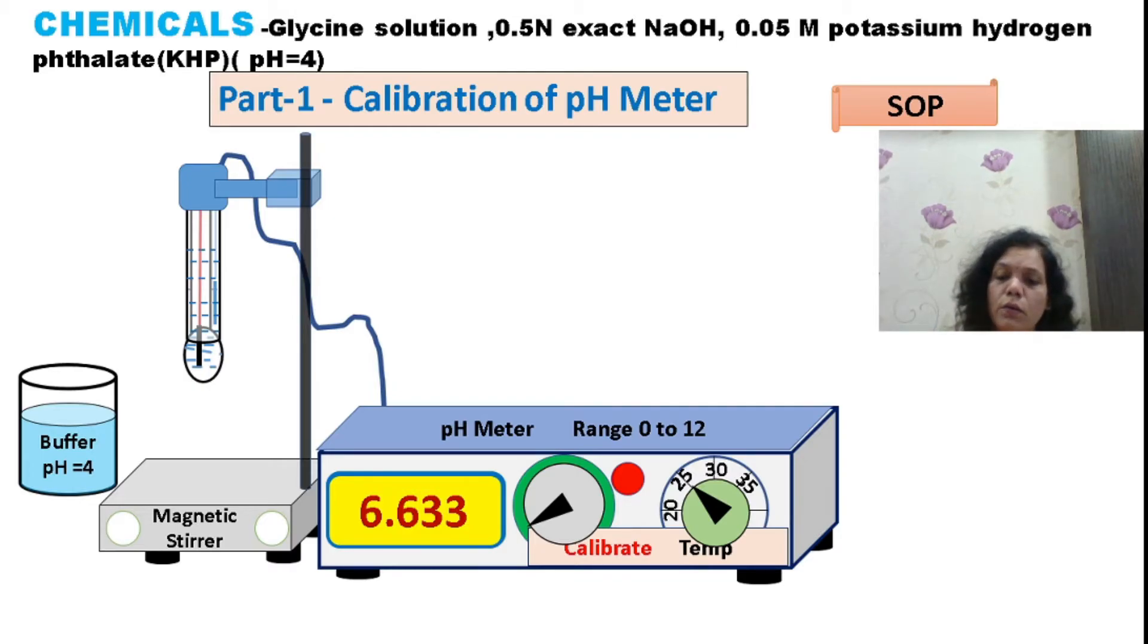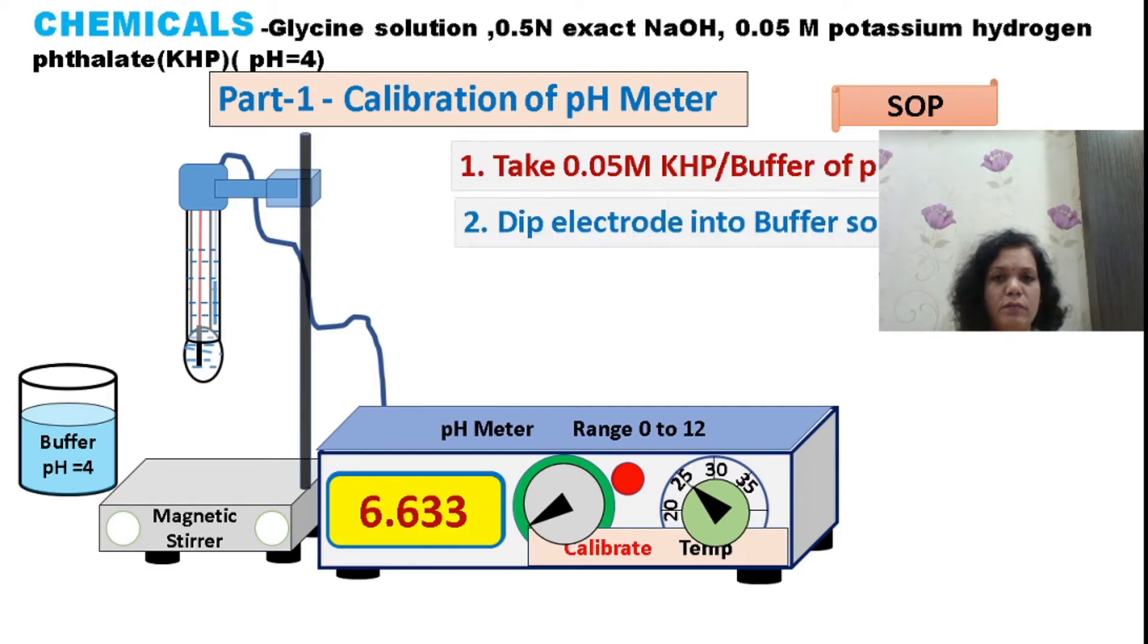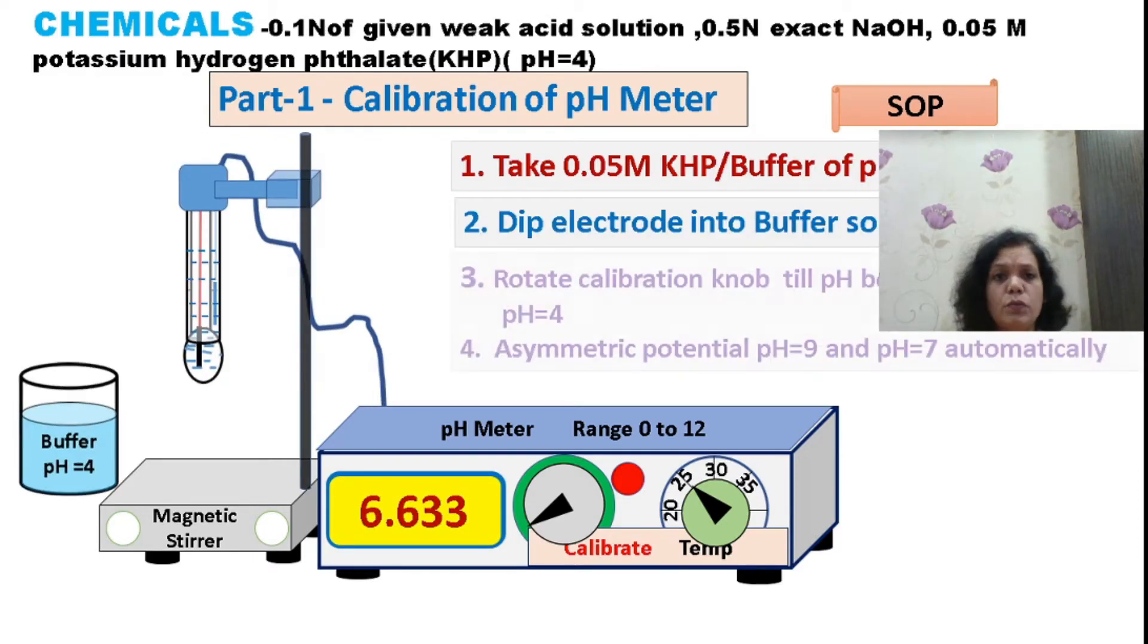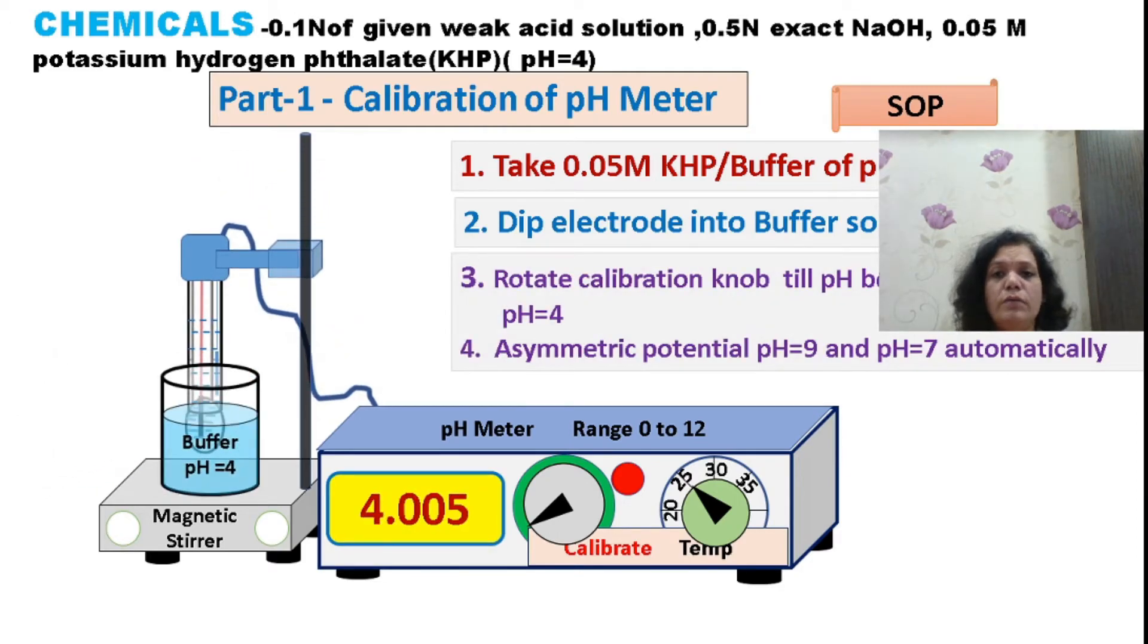I can calibrate the pH meter by dipping the glass electrode in a known pH solution. Here we have taken 0.05M potassium hydrogen phthalate solution. Measure the pH and check the digital display - the pH observed is 4.005. We can also do calibration at pH 9, and it will automatically show pH 7 when dipped in distilled water. Once calibration is complete, the pH meter is ready. Wash the electrode with distilled water.